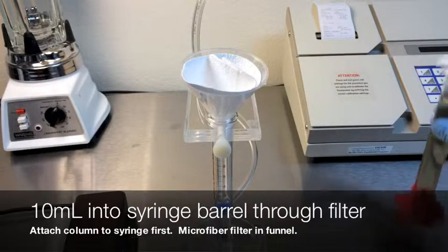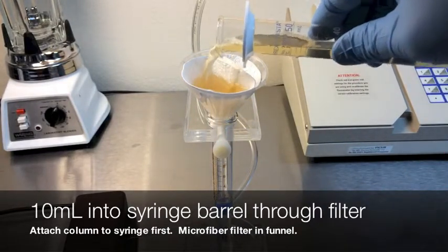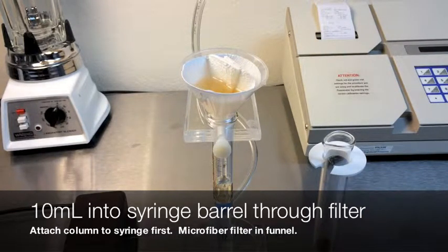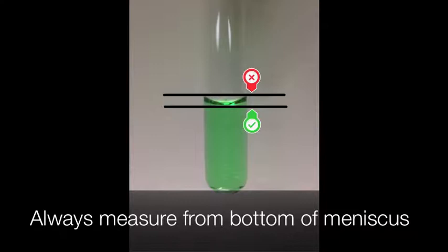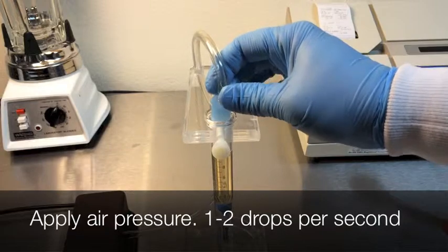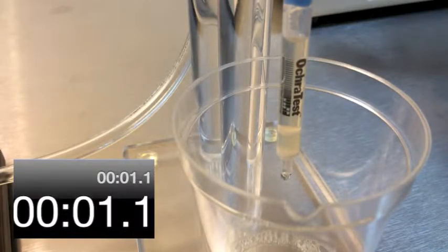Fold a microfiber filter and place it into a funnel. Fit the funnel to the top of the syringe. Attach the column to the syringe. Use the markings on the side of the syringe to collect 10 milliliters of the diluted extract. Apply air pressure to the syringe and pass 1 to 2 drops per second through the column until air passes through the column.